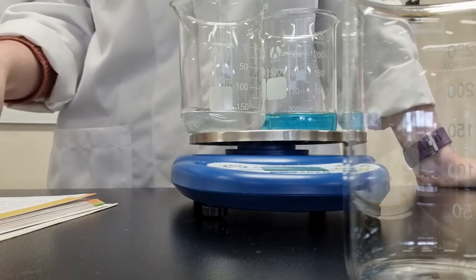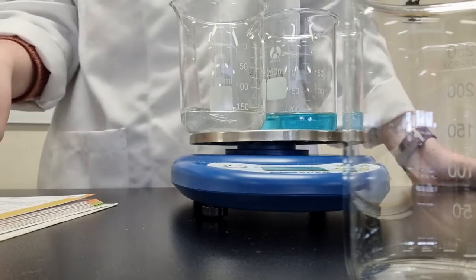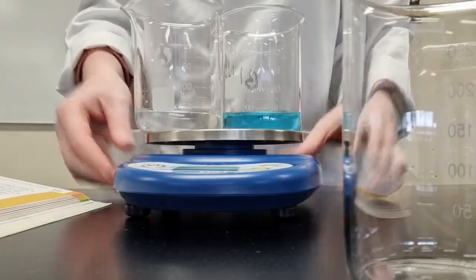Up to step 5, so carefully pour the copper sulfate into the sodium hydroxide and observe what happens. So hopefully you can see this.